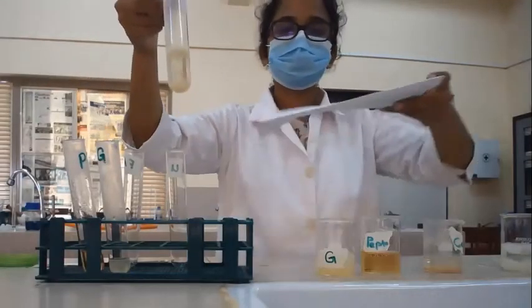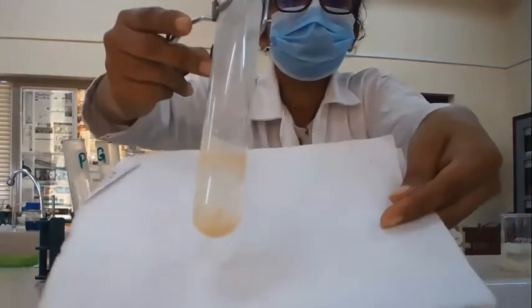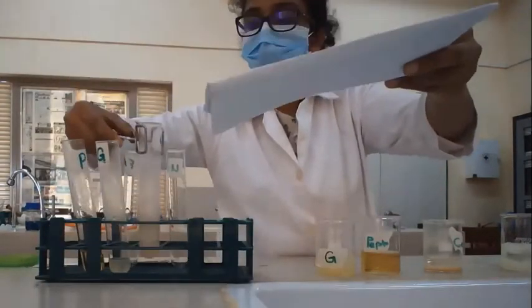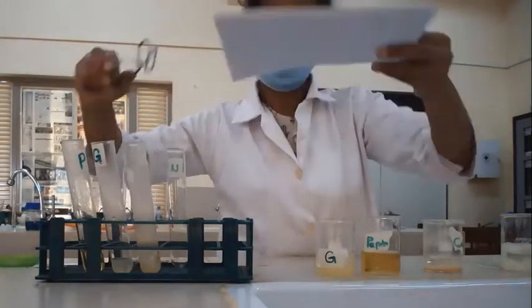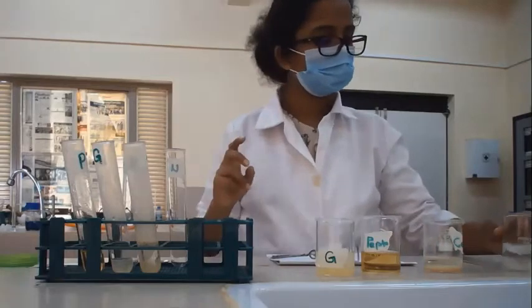Here in casein, you will see a coagulation. Then we will repeat the procedure for egg albumin.